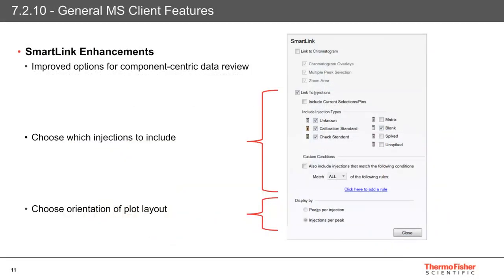Smart link functionality has been extended to allow greater flexibility when viewing large datasets, particularly those associated with mass spectrometry. It is now possible to link panes that adapt interactively for a more component-centric data review. You can now choose which injections to include by their type, such as unknown or calibration standard, and it's possible to choose the orientation of the plot layout by peaks per injection or injections per peak. These changes are saved in the Chameleon view settings file, allowing multiple views to be configured, which are available at the click of a mouse button.